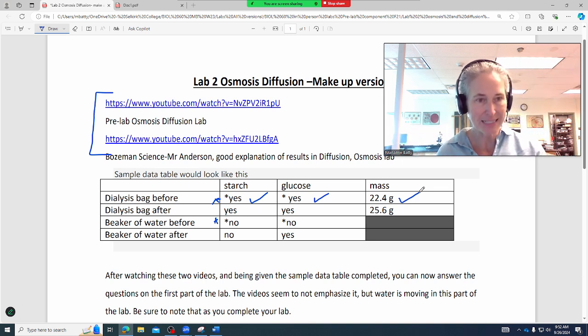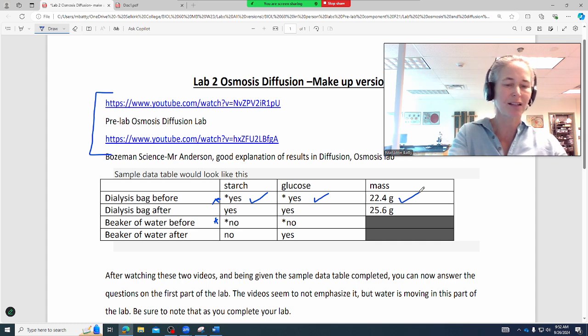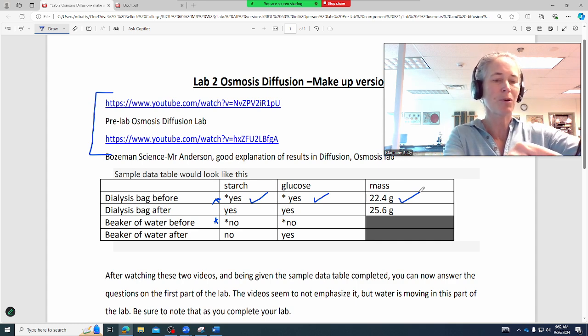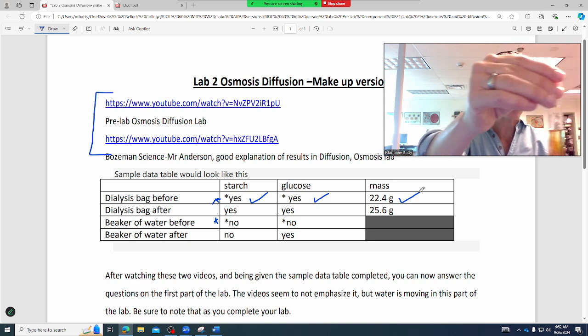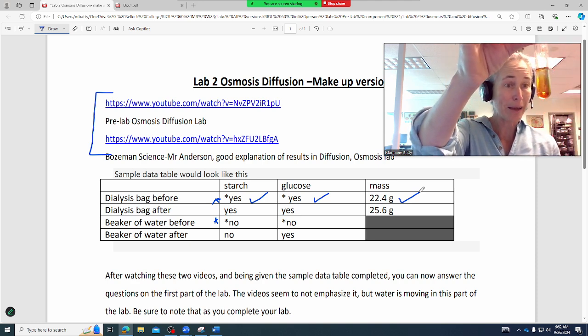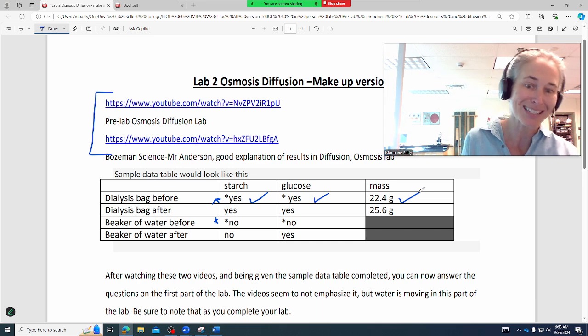If I were to take that same little test tube that has the distilled water in it and drop it with the Lugol's solution, what I'll end up doing is not having that changing color, that inky blue, greeny color. It'll just dilute and be more of that amber yellow color. And so if I do that, we can see that it's much different. It's very just yellow or amber color, right? So this is a negative test for starch. That means that there's no starch in distilled water.